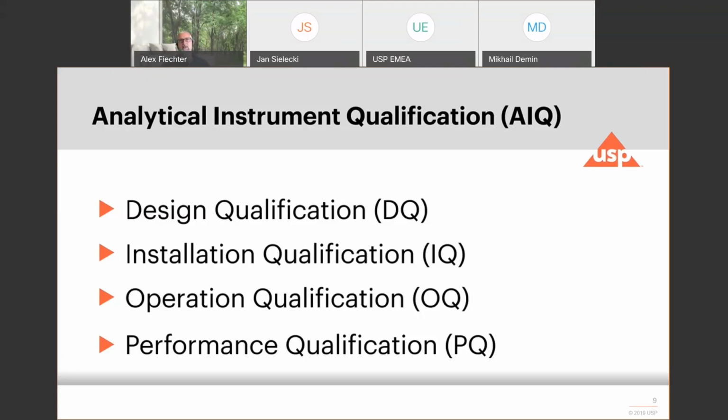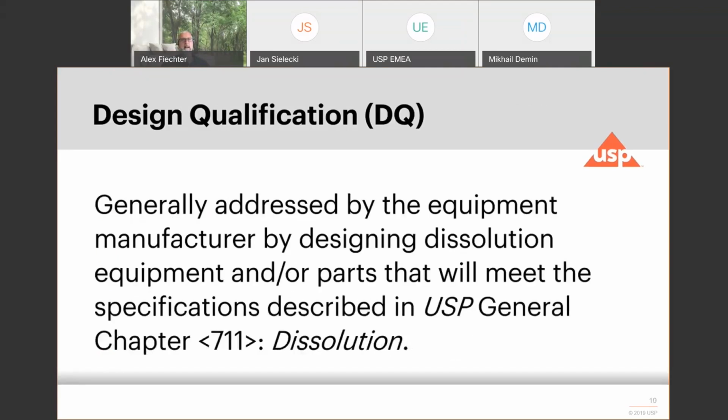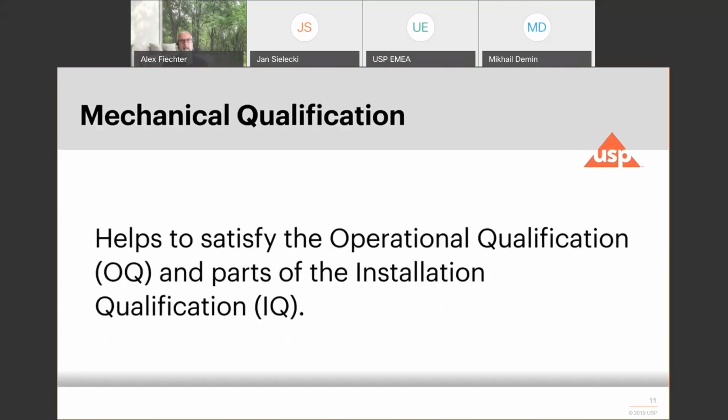The design qualification is a typical thing at the beginning, before you buy an equipment or before you use an equipment that you already have for a new project, or you continuously verify whether the purpose of this dissolution tester for the test that it is addressed for is still good. So you describe everything, the parts and whatever is required so that it successfully does the dissolution for the drug product that you are assessing.